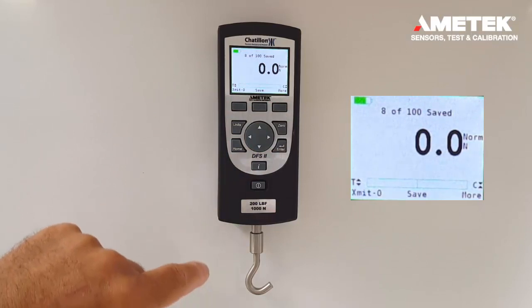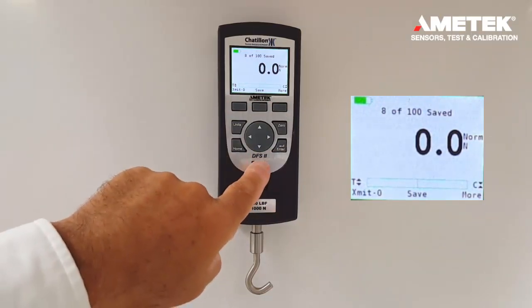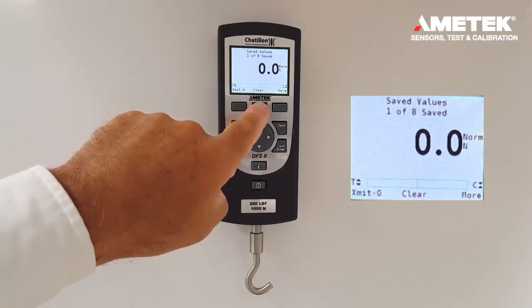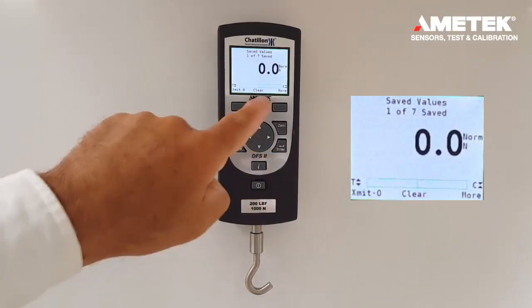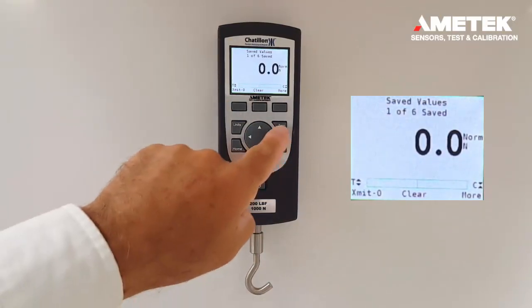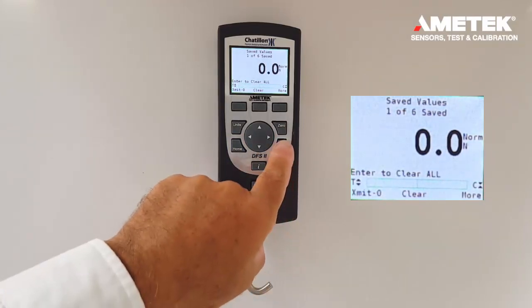So in order to change the mode, we need to clear the saved data. To do so, press the I button one time and you'll have the option to clear. If you press the clear button, you can clear one data point at a time, or you can clear all data points by pressing the zero button and then the enter button.